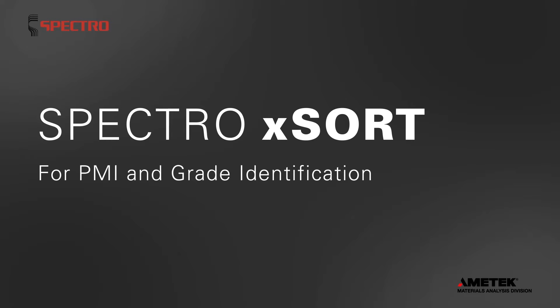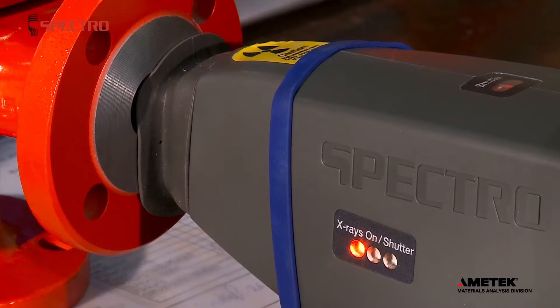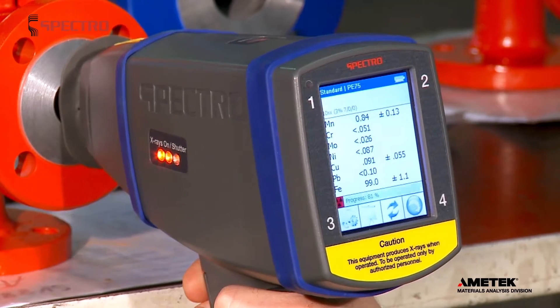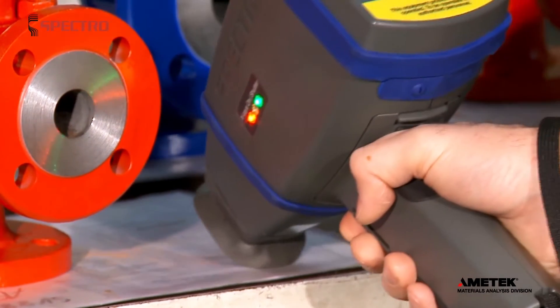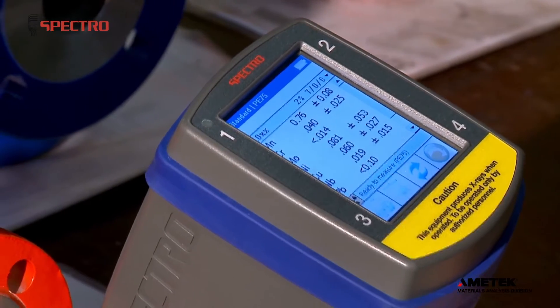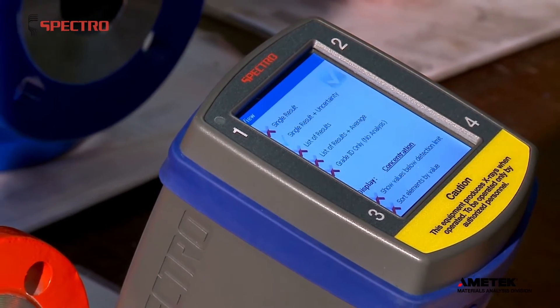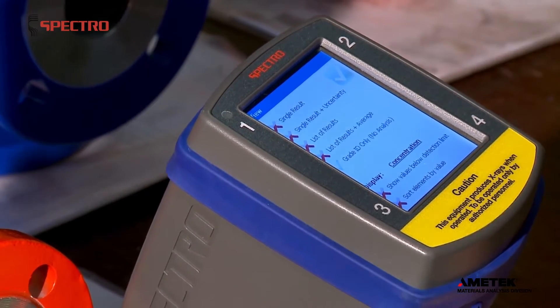Spectro Exsort for PMI and Grade Identification. When dealing with incoming parts, your Spectro Exsort handheld spectrometer is ideal for the quick inspection of materials and for positive material identification, or PMI. Just take your sample reading. In seconds, the screen displays a precise analysis of the composition of the sample.